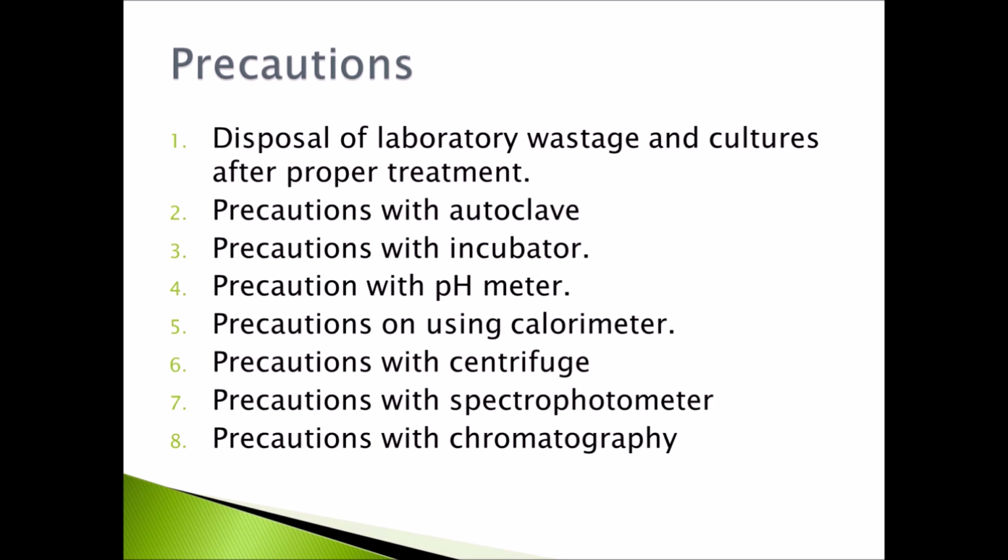Now, about precautions with a spectrophotometer. Allowing the lamps and electronics to warm up, using the correct wavelength, and wiping fingerprints and spilled sample off the outside of the cuvette before measuring should be observed.